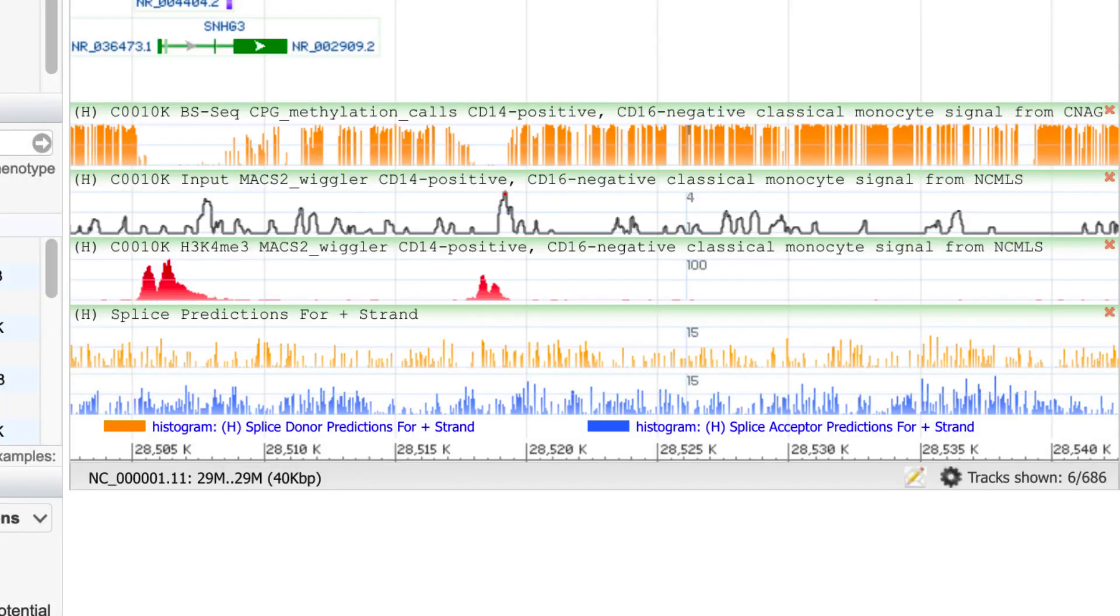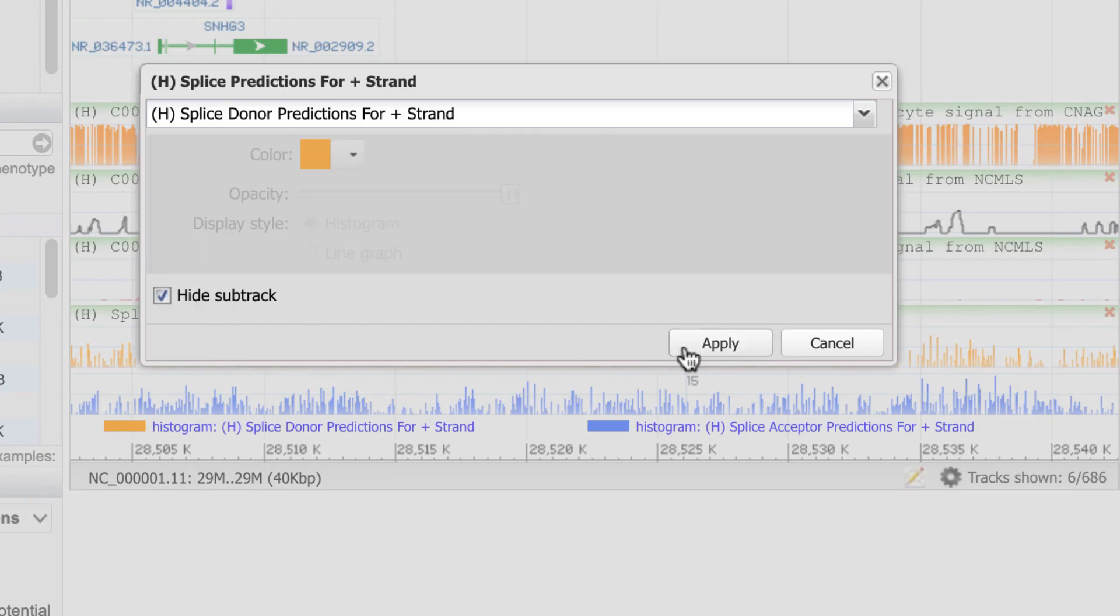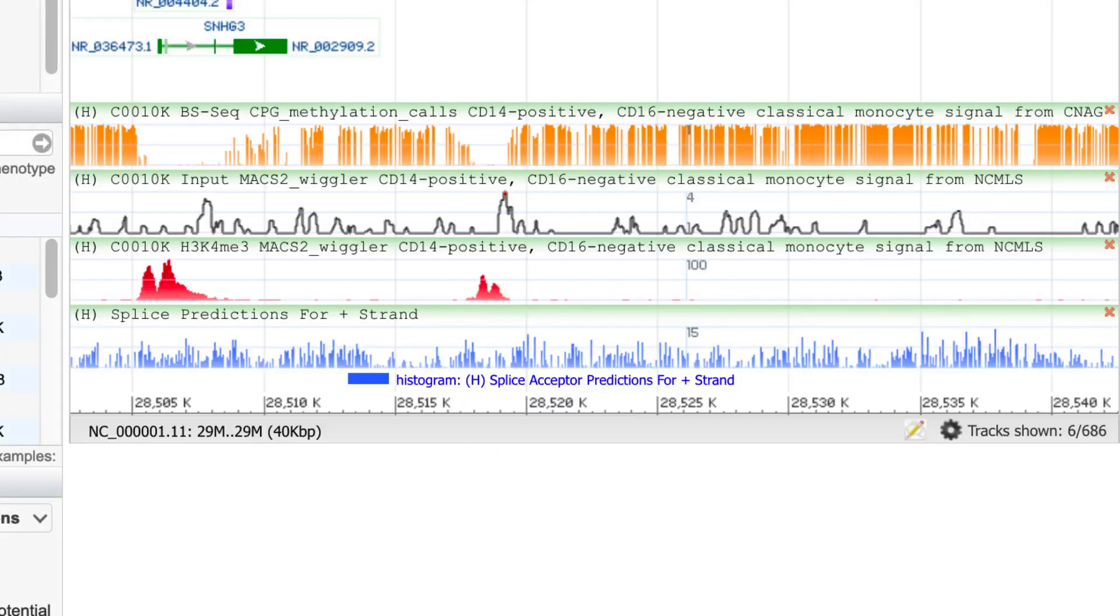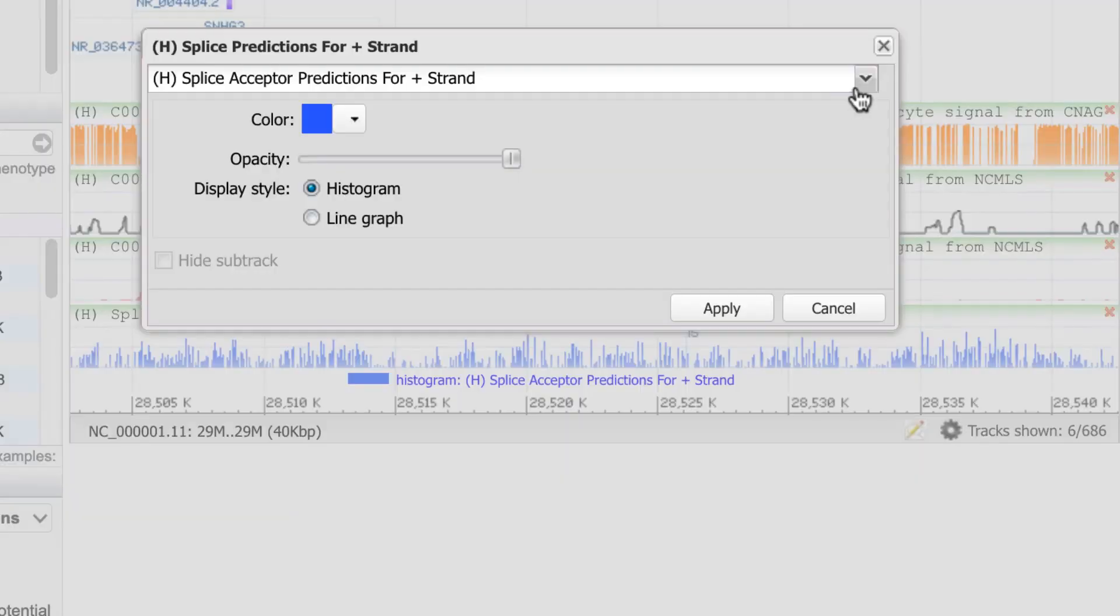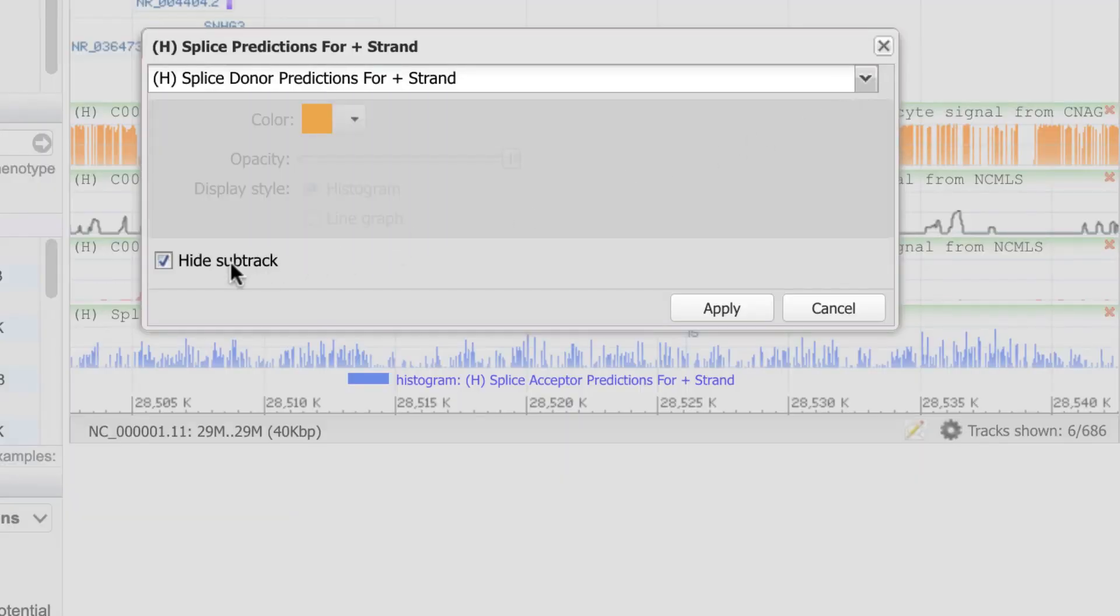You can also hide one of the tracks. To recover that sub-track, go back into the menu, select the hidden sub-track, and uncheck Hide Sub-Track.